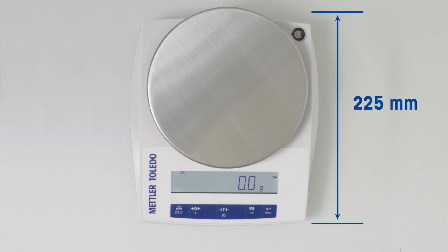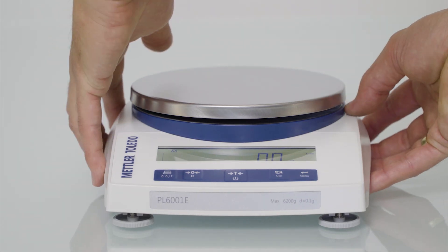The ultra compact design of the PLE makes them perfect for small spaces. They are solidly built from quality materials and are still light enough to pick up and carry anywhere you want to weigh.